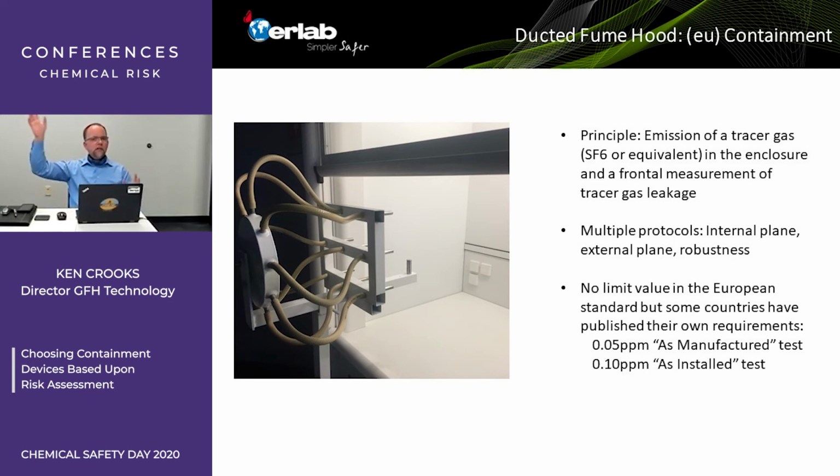The supply air might be a little bit closer to the fume hood than you would like, but it had to be there. The fume hood might not be in a perfect location. It might be a little closer to a door or a window. There could be thermal drafts in that. So it's allowed to increase to 0.1 ppm as installed in the field. And I agree with that methodology. That makes sense to me.